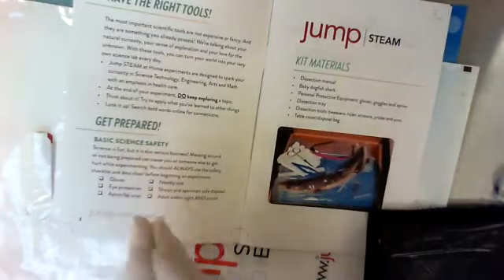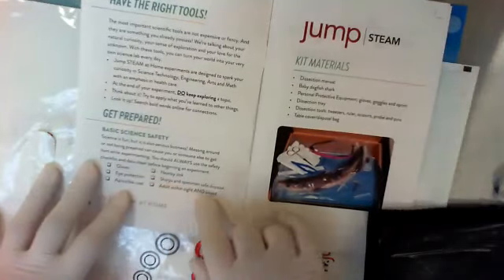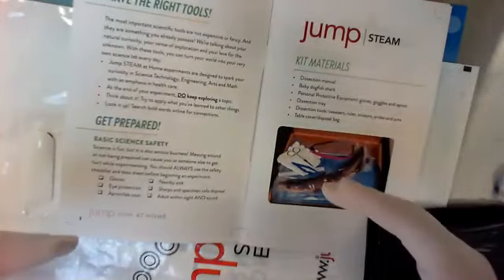If you rip a glove, yell for them, see if they can bring you a sack. If you poke yourself, if you need a Band-Aid or whatever. Next, sharps and specimen safe disposal. We have a big bag that we're going to do everything on. When you're done, you're going to roll it all up in the bag.